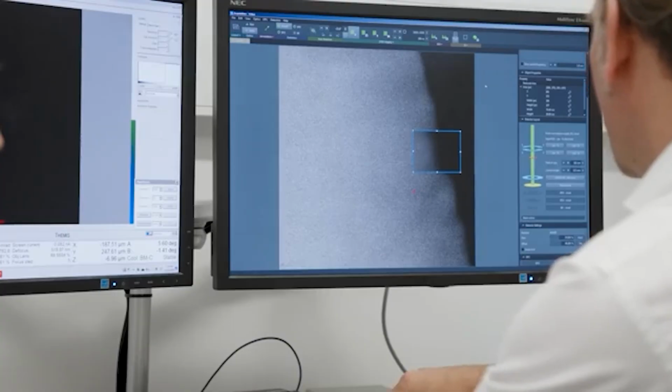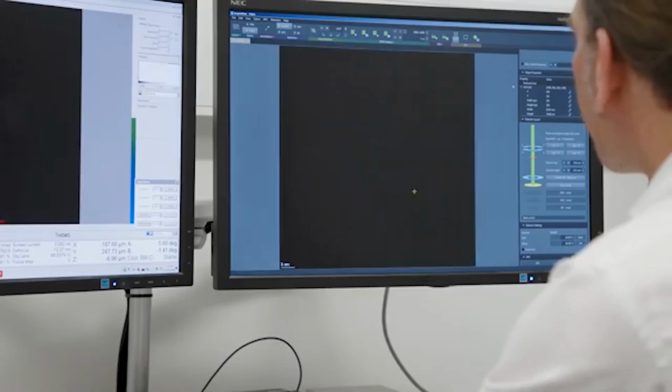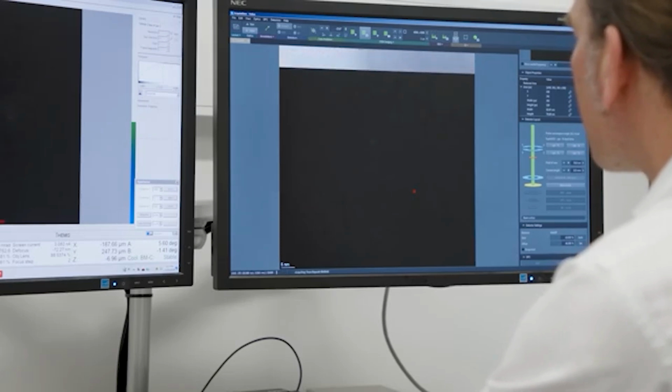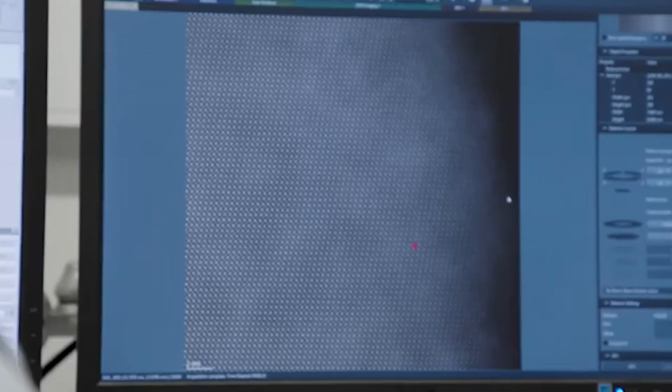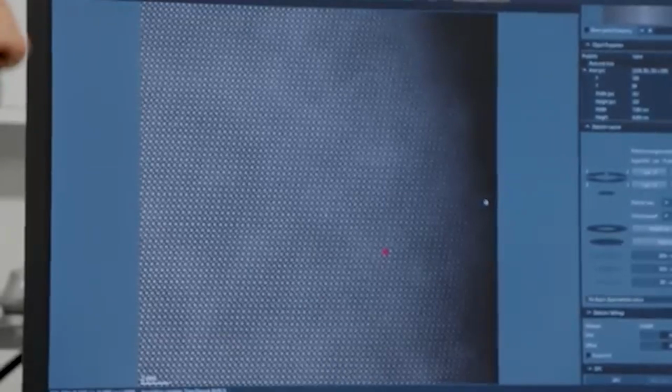focus, what are you really looking for? I look for this edge to become sharp. See atoms. What? Just like that. That's wild.